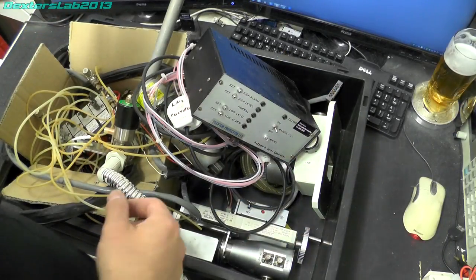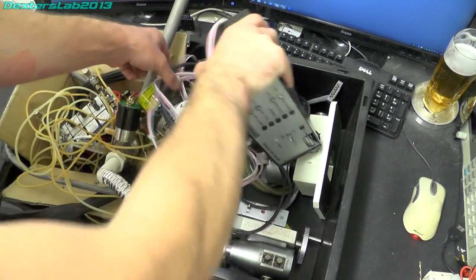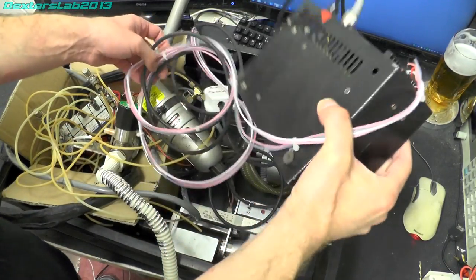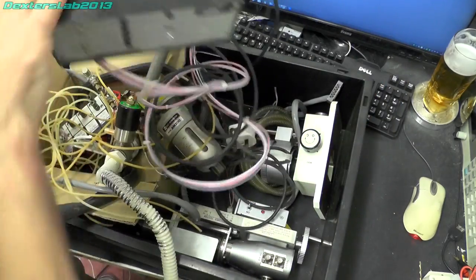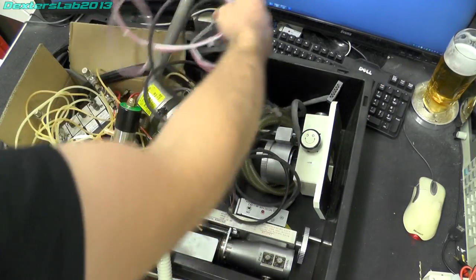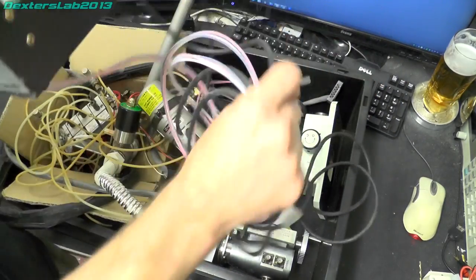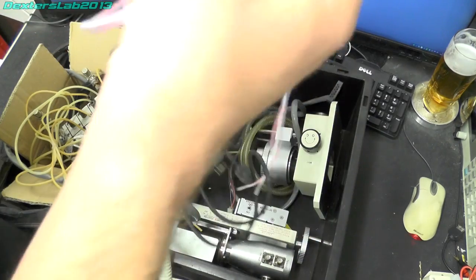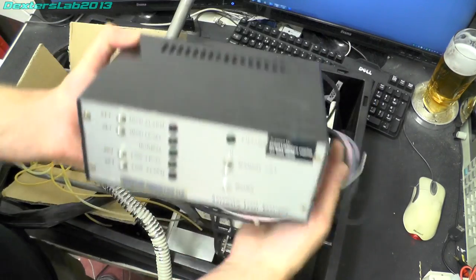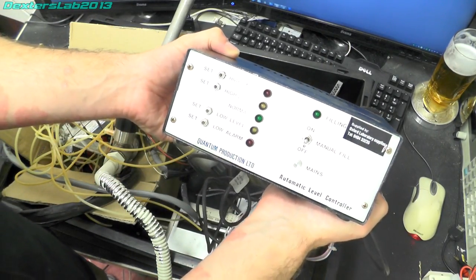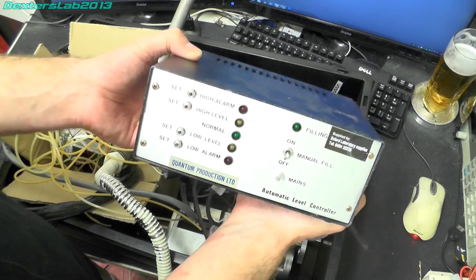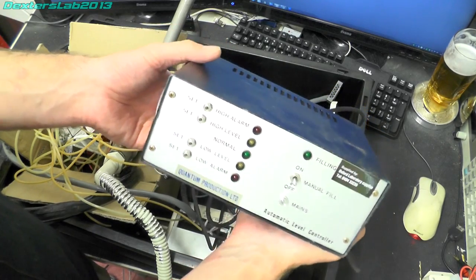Okay moving over to this larger box we have this unit here. Grab it all out, there we are. So on the front it just says it's a Quantum Production Limited automatic level controller.